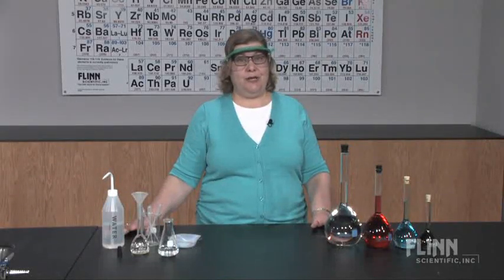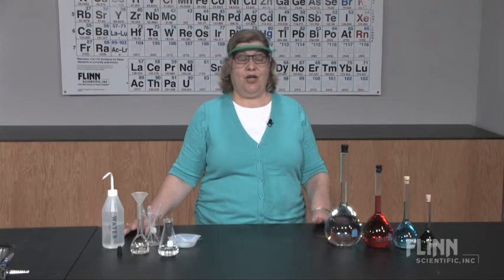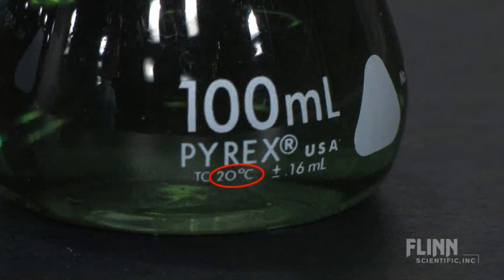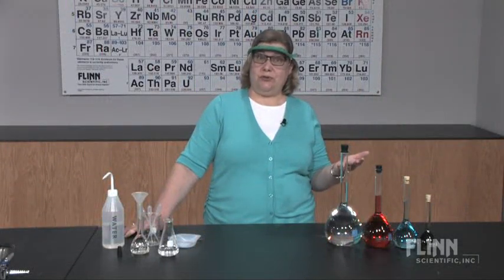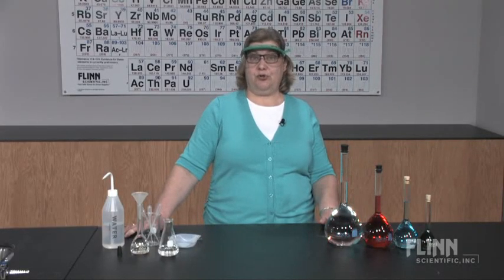Here are a few tips for taking full advantage of the potential accuracy of a volumetric flask. First, temperature matters. You need to be at room temperature — 20 degrees Celsius. If the solution absorbs or releases heat as the solute dissolves, allow the liquid to re-equilibrate at room temperature before filling to the mark.